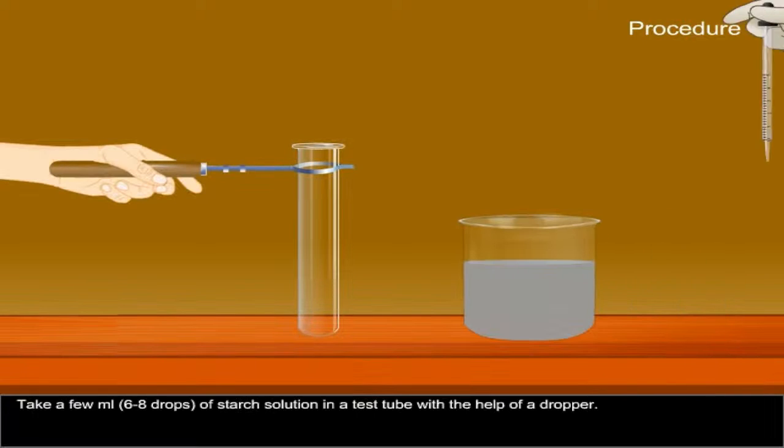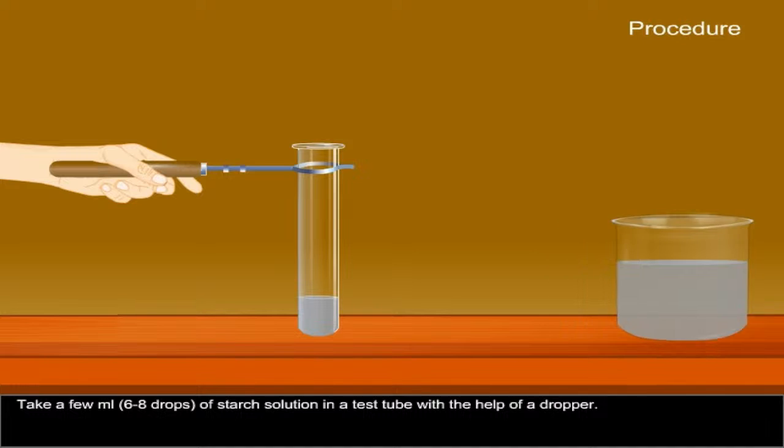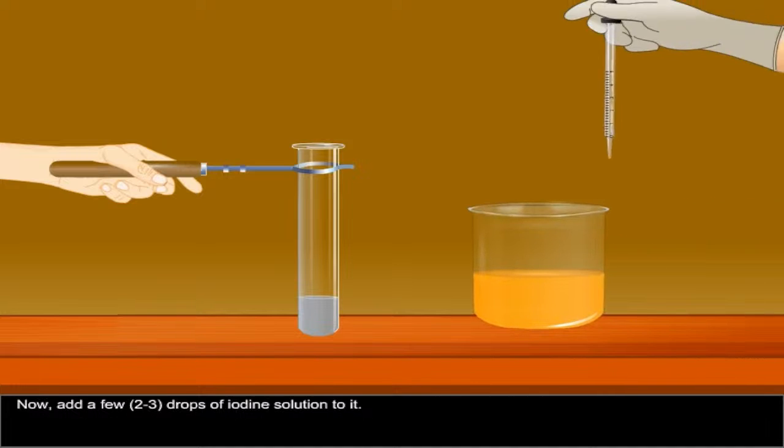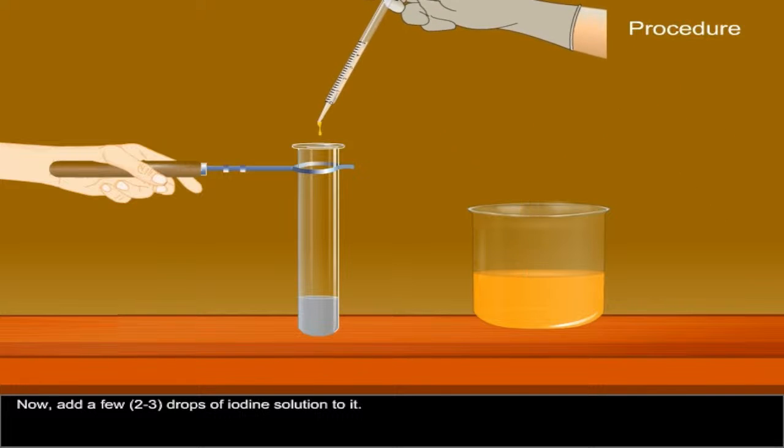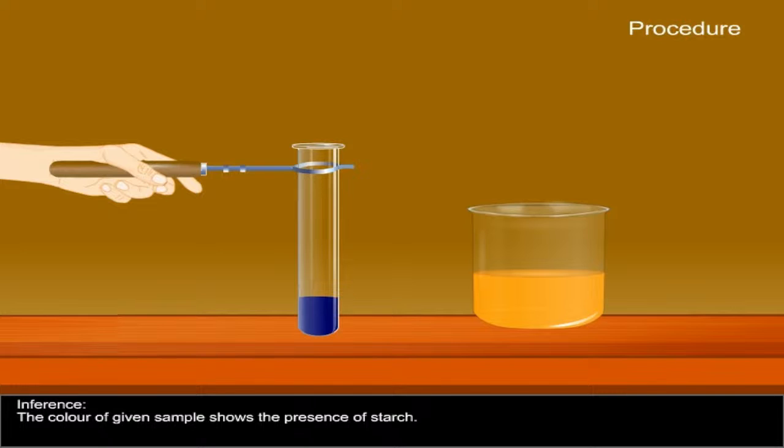Procedure. Take a few milliliters of starch solution in a test tube with the help of a dropper. Now, add a few drops of iodine solution to it. Observe the change in color of the mixture. Observation. The color of the mixture changes to blue-black. Inference. The color of the given sample shows the presence of starch.